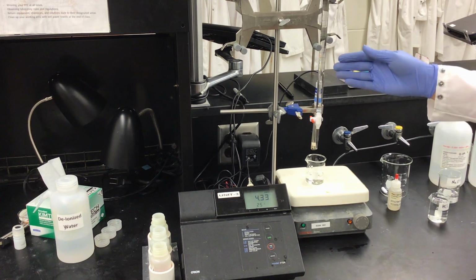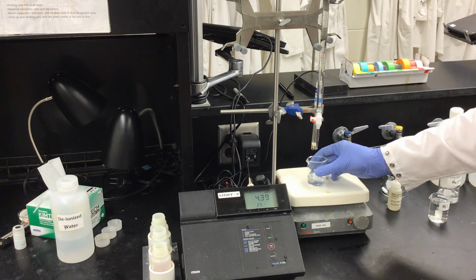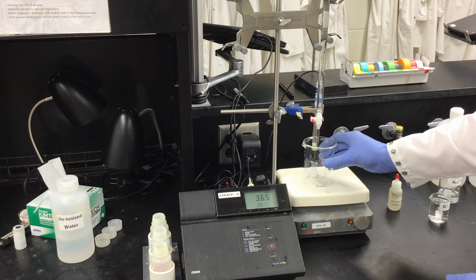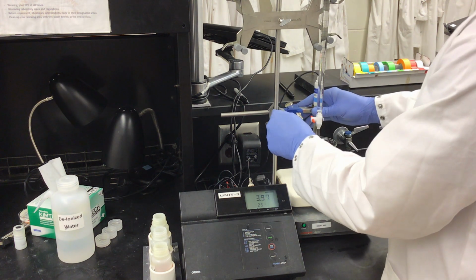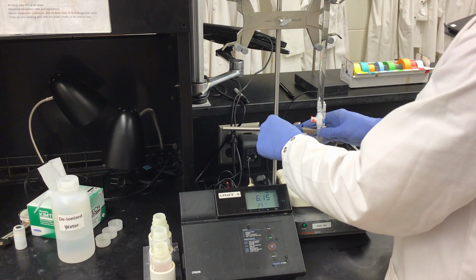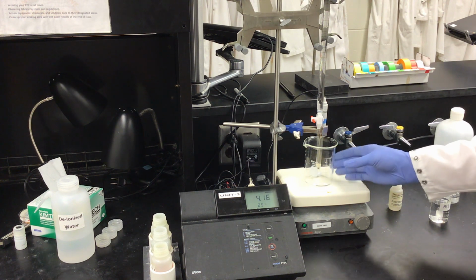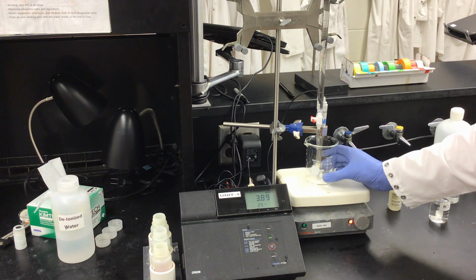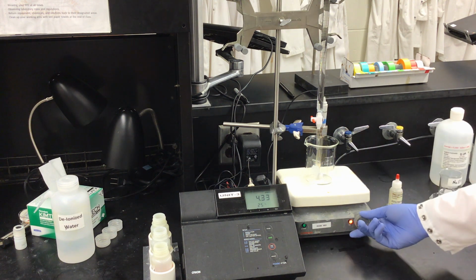And there we are. I now have my 50 ml burette filled with sodium hydroxide, and I have removed all the air from my system, so I can remove my waste beaker, and now I can attach my beaker that I will be using for the titration. Here is my probe that I will need in order to read the pH of the solution. So I need to lower this down into my beaker. Be very careful with the probe since its tip is made out of glass. You need to have it sitting above our stir bar that we have inside the beaker. As you can see, there is space between the tip of my pH probe and my stir bar.